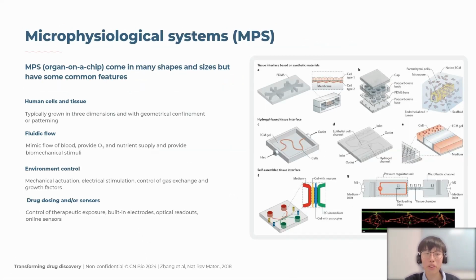So, for those of you who are not familiar with what MPS is and what it does, here is a brief overview of the technology. MPS are also known as organ on a chip, which are designed to better resemble human biology in vitro, and they are characterized by a few common features.